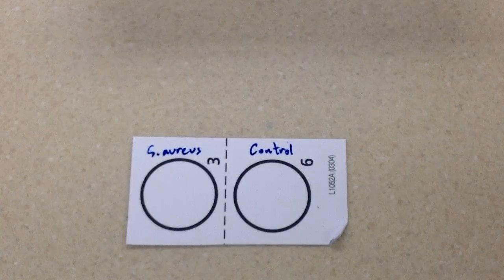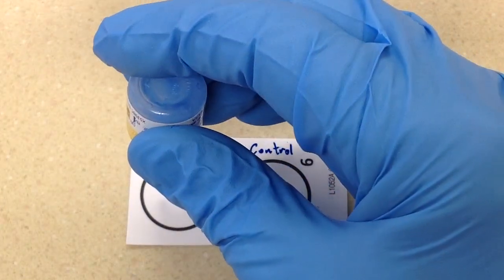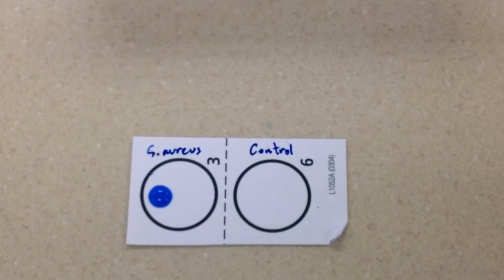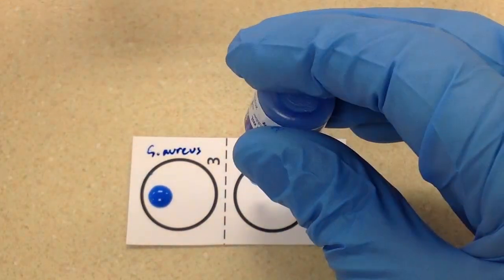We'll put one free-falling drop of test latex on the left, and then one free-falling drop of the control latex on the right.